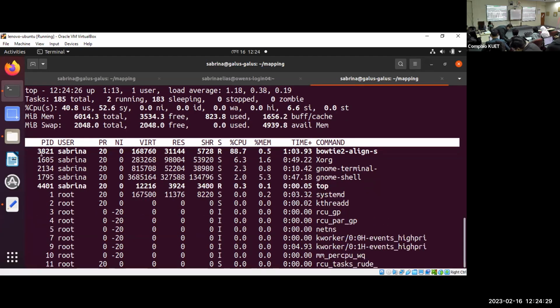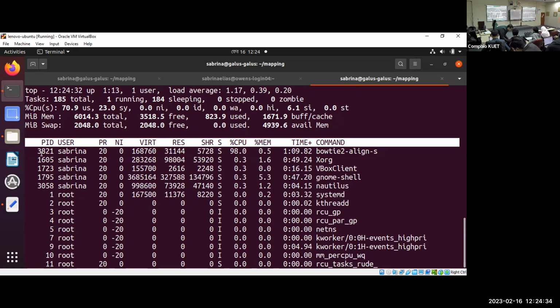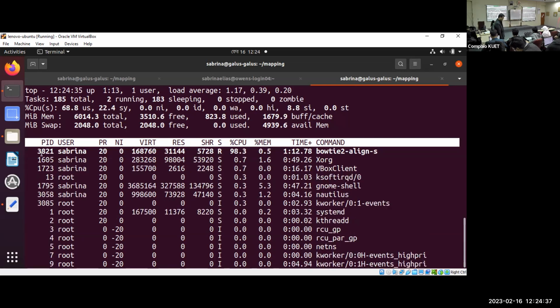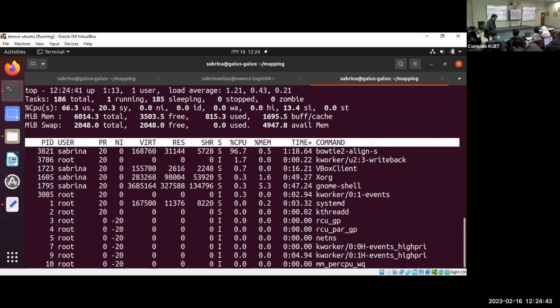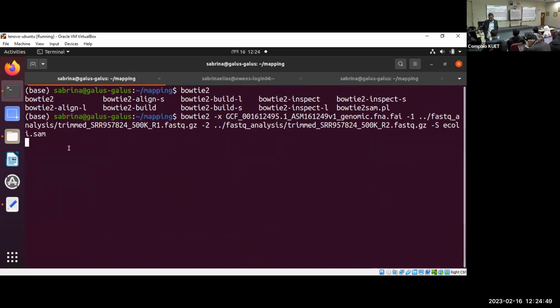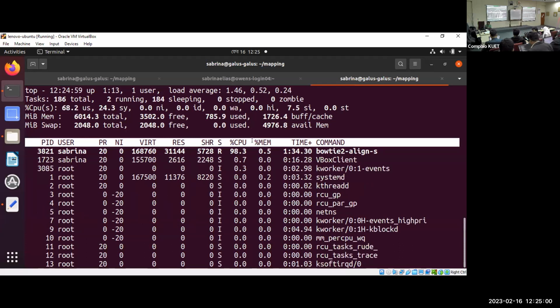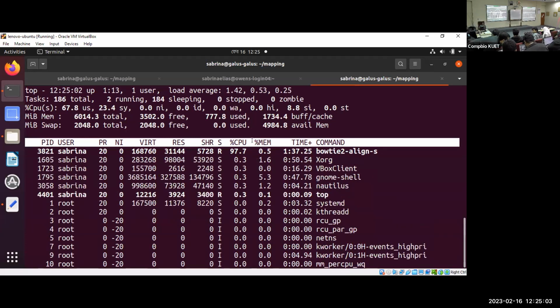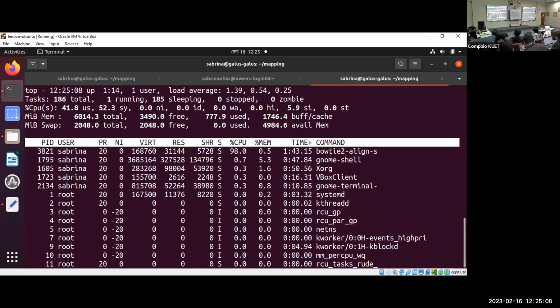And you know that every job in a computer has a name or ID, which is a PID, or process ID. And there are many more details which you will understand when you explore on your own. So it's still running, because sometimes we may get confused about whether it is actually running or not, because it's not showing any verbose output. So we can just check here in top, like the task manager in Windows. When it stops, I can check that it has stopped and then see the results.